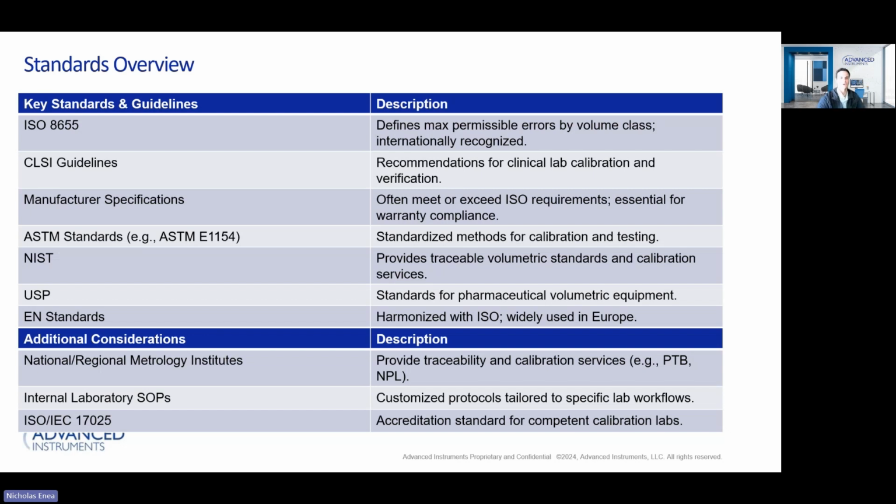So without boring everyone here, these are a list of the majority of the standards that we see in the liquid handling world, and often what we need to comply with when it comes to tolerances and limits and things that we're setting for our liquid handling. Questions on any of the standards? Any color that we could provide?